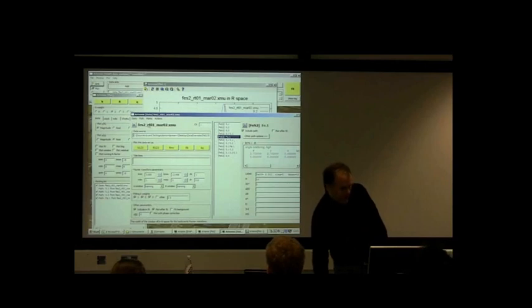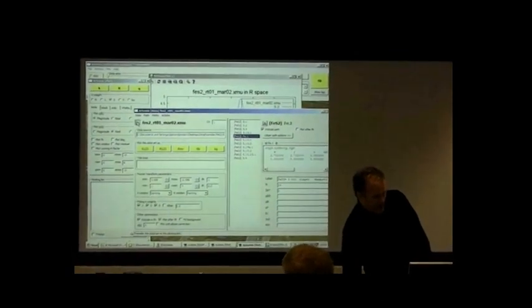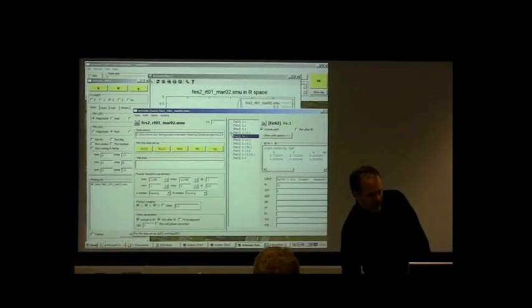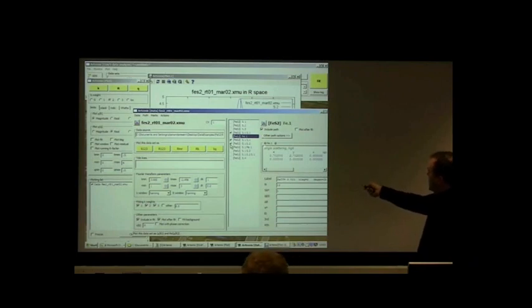So I'm going to first clear this list, and then I'm going to put the data back in the list. And now what I want to do is consider these. On top of all of our single scattering paths, which are these ones, and we know those are all single scattering paths because they only have one atom listed, these other ones are various kinds of multiple scattering paths.